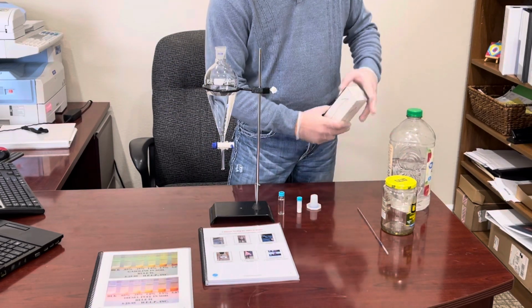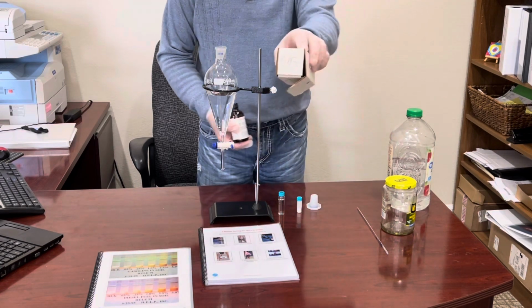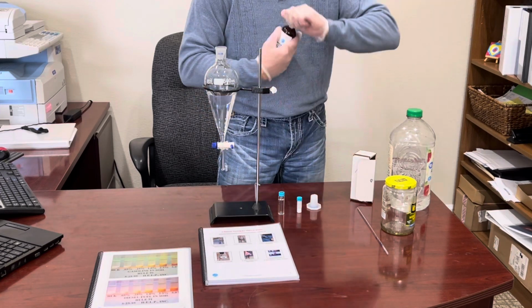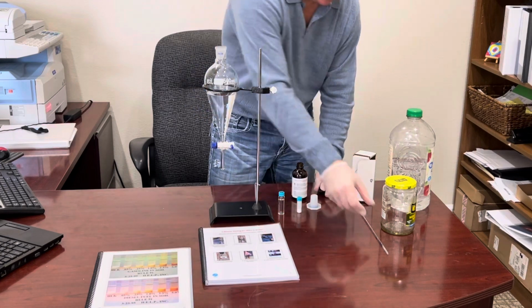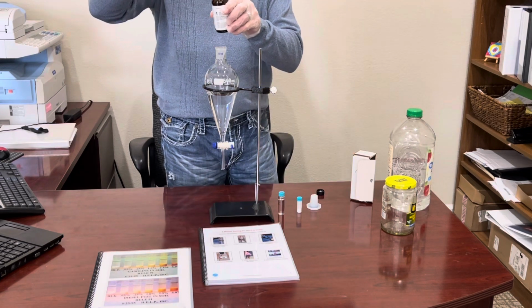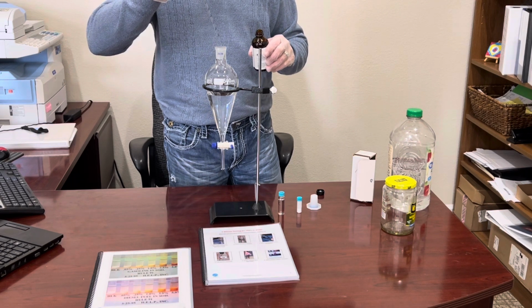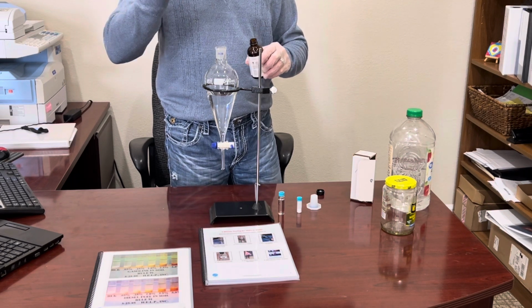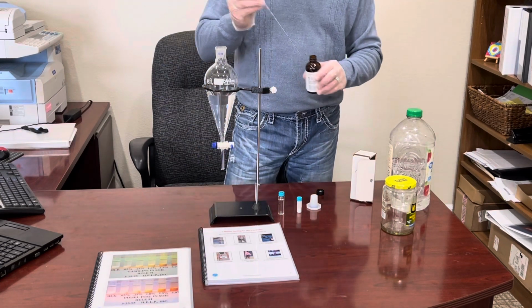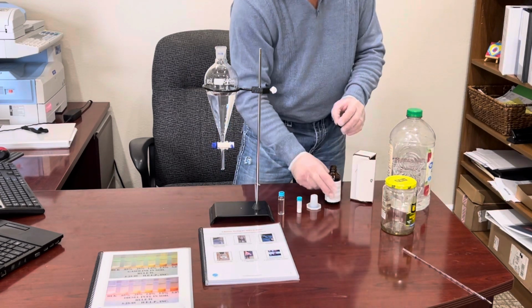Now, let's add our contaminant, which is some old gasoline. We are simply going to put in 1 drop of gasoline. Well, actually, we'll put 1 drop in. 1 drop. There. 2 drops. There we go. So we've got our contaminant in our water sample.